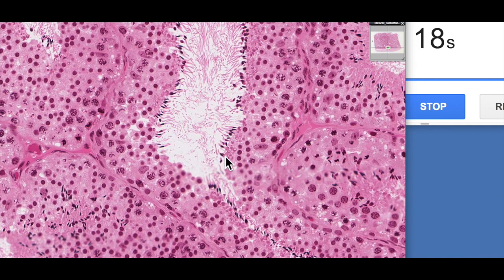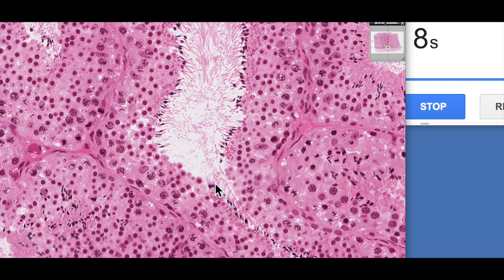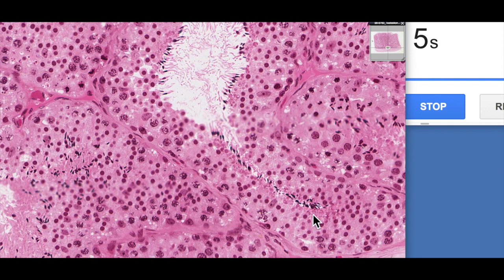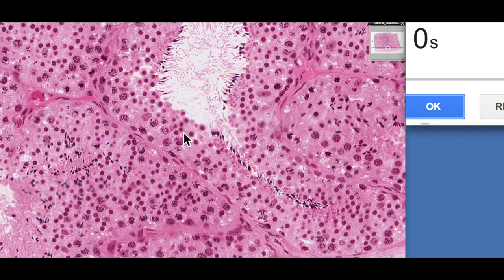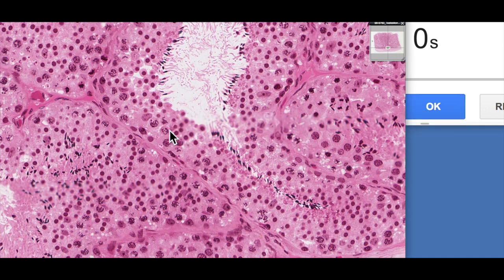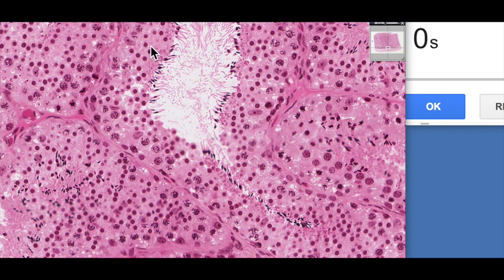Different parts of the seminiferous epithelium are actually undergoing spermatogenesis at different rates. You can see there are no spermatozoa here, but there are spermatozoa over here — an indication that different parts of the seminiferous tubules are undergoing different rates of meiosis. This is known as the cycle of the seminiferous epithelium, meaning there's always a continual turnover of sperm, so that males after puberty always produce sperm, basically until death.